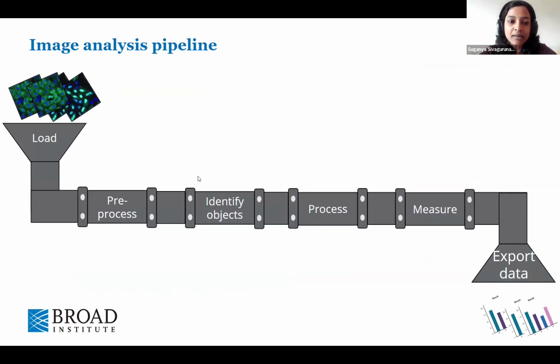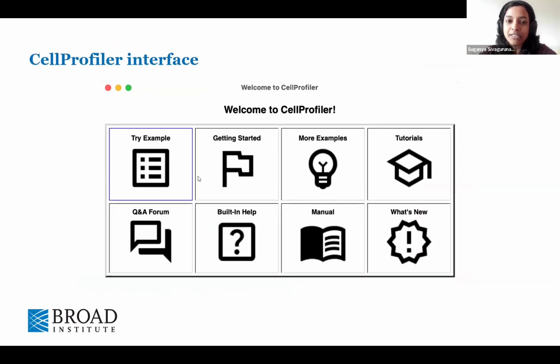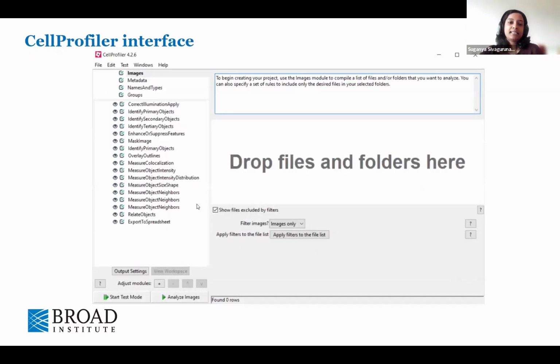We'll begin looking into more about the interface and how the different settings work in CellProfiler. When you download and open the software, this is the welcome screen that you would see. And each of the icons here, I'll go into the details at the end of this talk. We'll go in more details about the settings now.